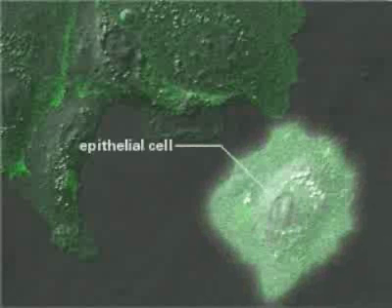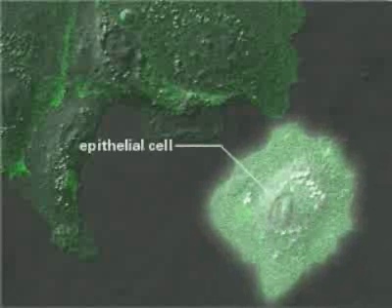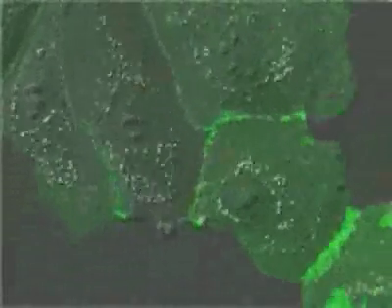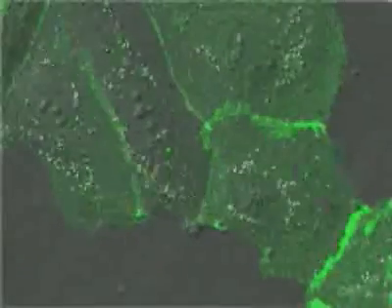These epithelial cells express green fluorescent cadherin. They are grown at low density so that isolated cells can be observed. Initially, labeled cadherin is diffusely distributed over the whole cell's surface.